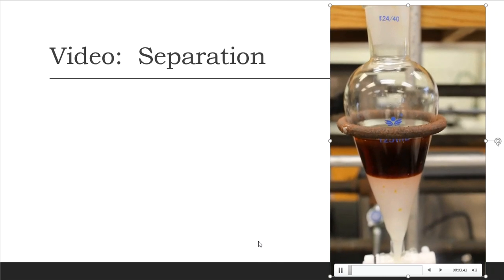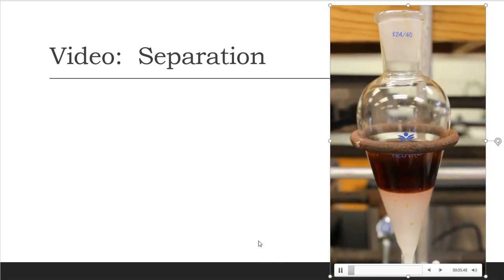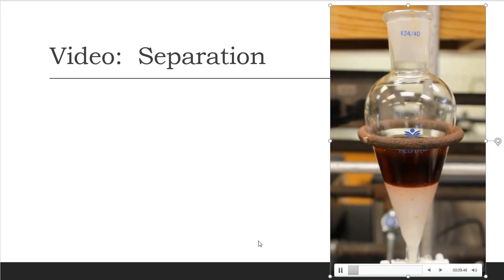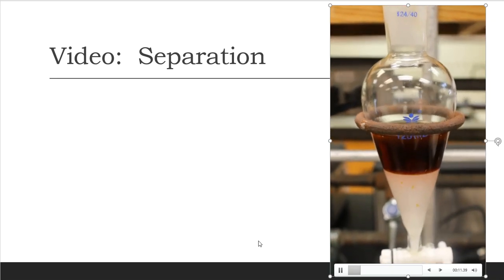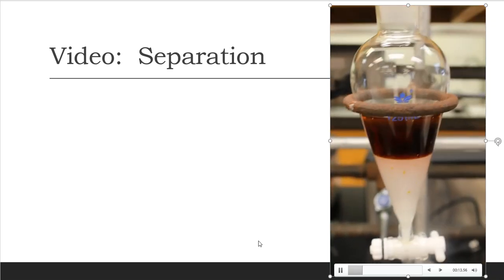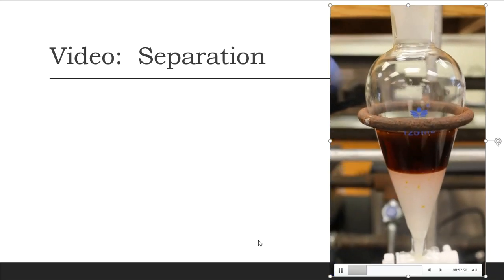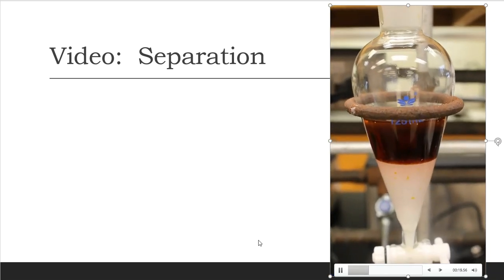Okay, so you're looking at the separatory funnel edition of my hexanol product. Whether it's 2-hexanol or 1-hexanol, that's really up to me to find out. And the water layer, or the aqueous layer. Now, how do I know which one's which, right? Which one of these two layers is hexanol? Which one is going to be water?